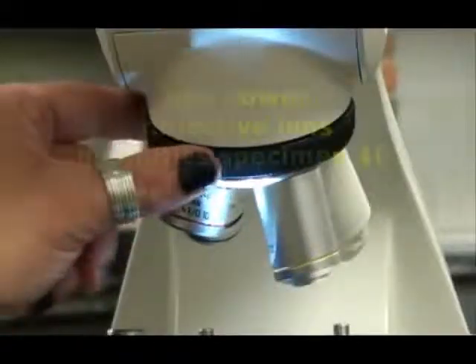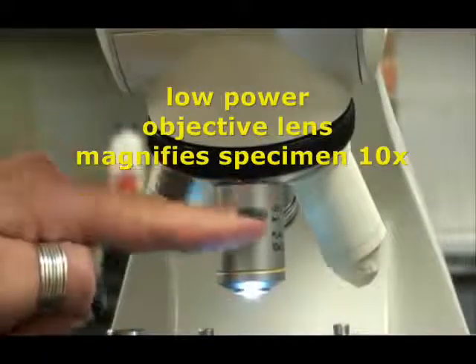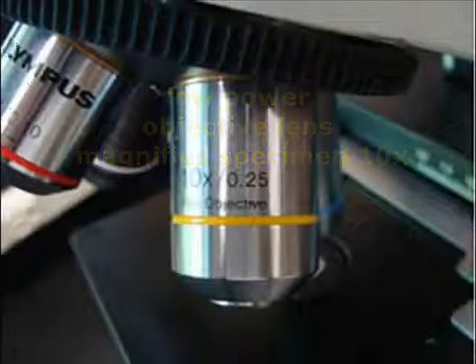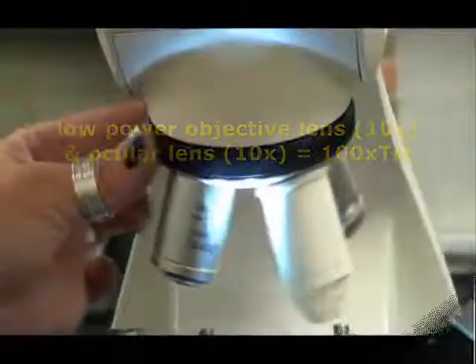The next objective lens is the low-power lens. It has a yellow band around it and magnifies objects 10 times actual size. So the total magnification when using the low-power lens is the ocular, which is 10 times, multiplied by the low-power lens, which is also 10 times magnification, for a total magnification of 100 times actual size.